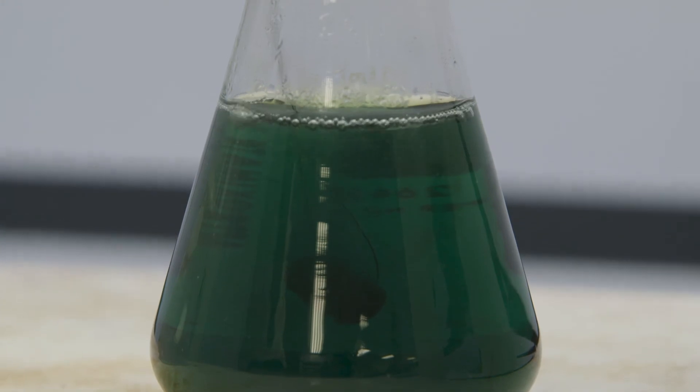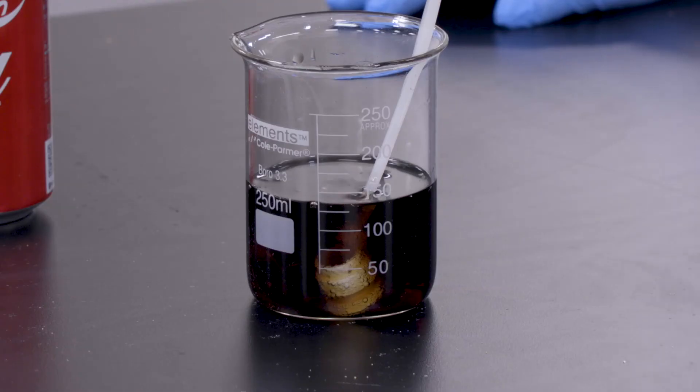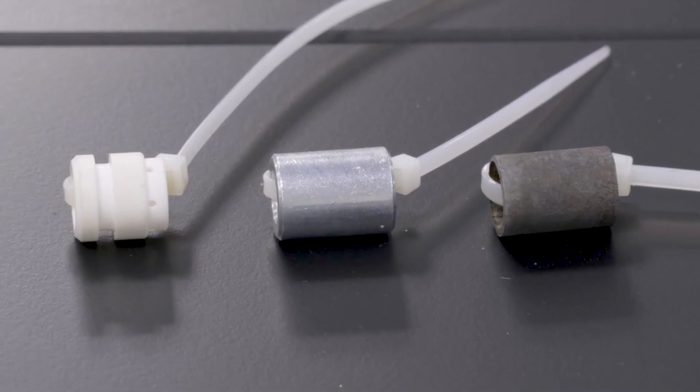In general, in a material science turf war, the ceramics are always going to win in the corrosion test. They can hold up much better in highly corrosive environments like sulfuric acid, hydrochloric acid — pretty much anything that you can think of that would corrode, the ceramic is going to outperform the metal. Anybody want some nasty cola?